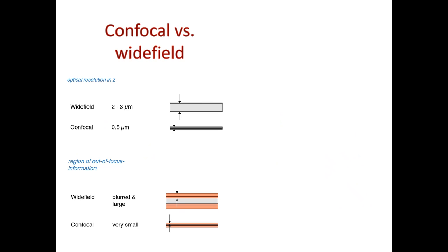So let me see. And different types of microscopy, confocal versus wide field. Wide is relative. They're called 2 microns wide. Or it could be 0.5. So this is basically the plane you're focusing on. So the information you get from here is sort of averaged over 2 microns. But because of transparency, you will see a little bit of things in the bottom.